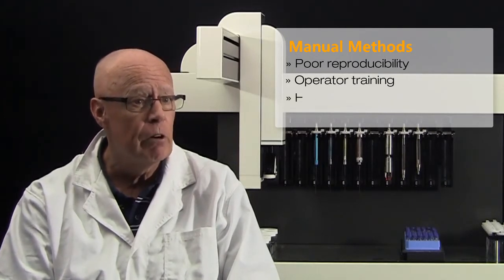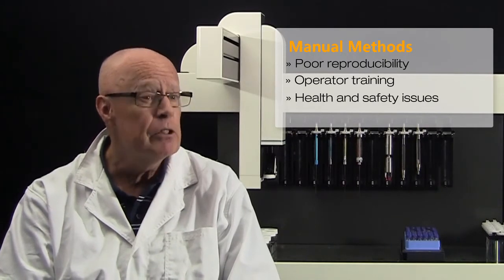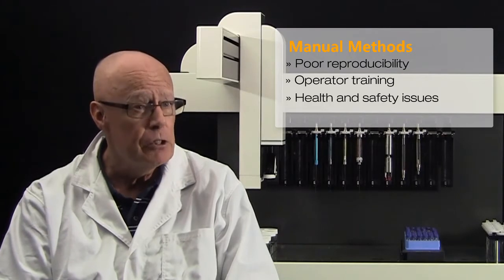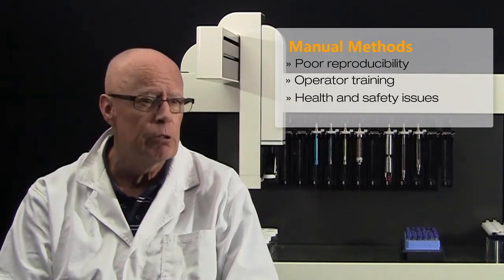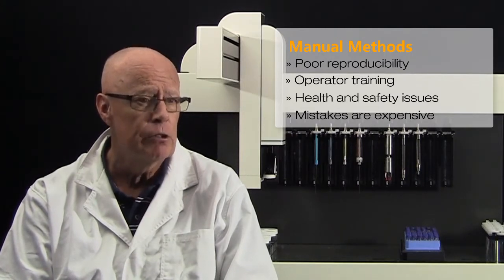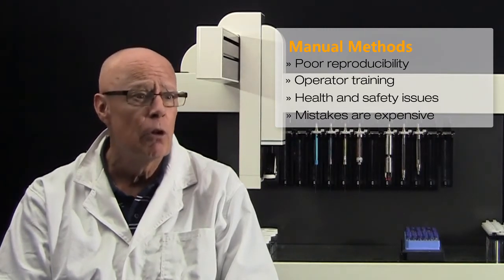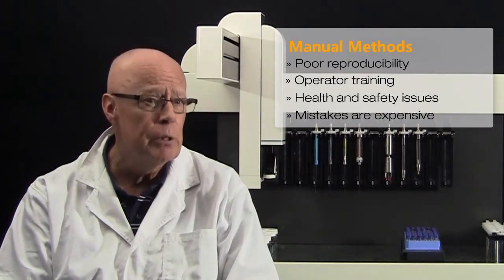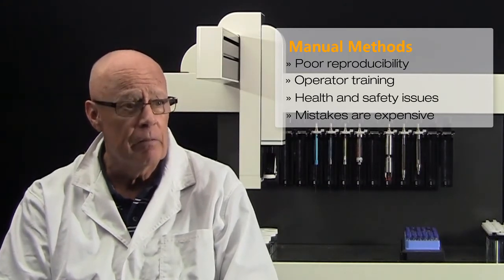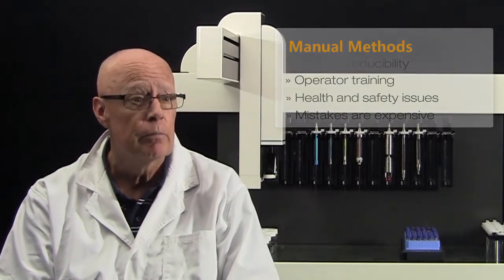With manual methods, there are health and safety concerns because we're using organic solvents, and even some of the target analytes themselves can be toxic. And this is the big one. If the standards are not prepared correctly the first time, we won't know until we are looking at the data coming off the instrument. And this could be maybe a day, even longer away. So instrument time has been wasted before the standards are prepared and run again. So rework is both time-consuming and very expensive to do.